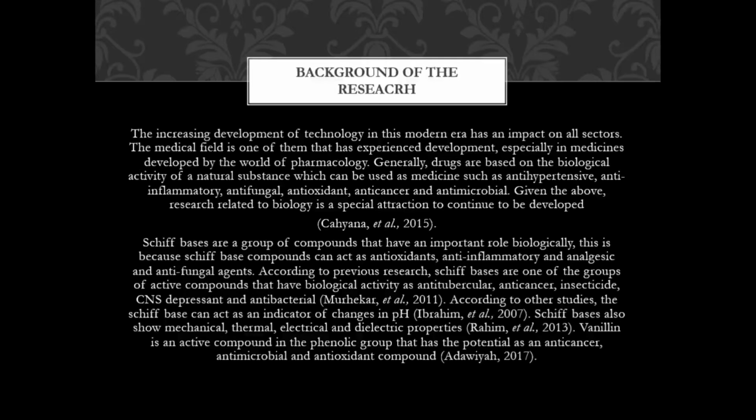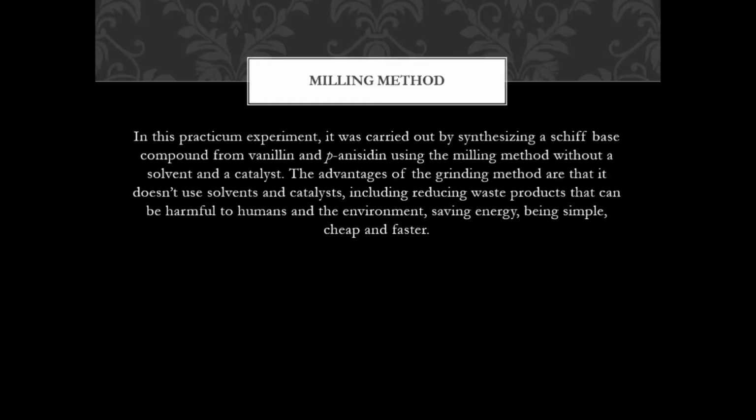The increasing development of technology in this modern era has an impact on all sectors. The medical field is one of them that has experienced development, especially in medicine developed by the world of pharmacology. In this practicum experiment, a Schiff base compound was synthesized from vanillin and p-Anisidine using the milling method without a solvent and catalyst. The advantages of the grinding method are that it doesn't use solvent and catalyst, reducing waste products that can be harmful to humans and the environment, saving energy, and being simple, cheap, and faster.